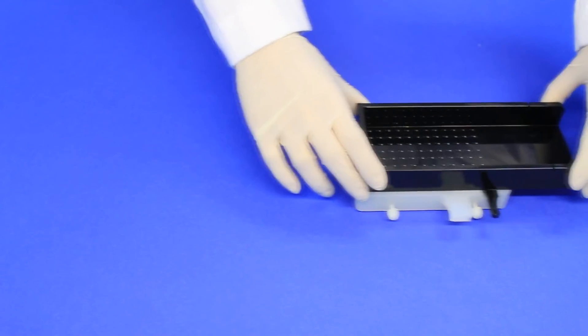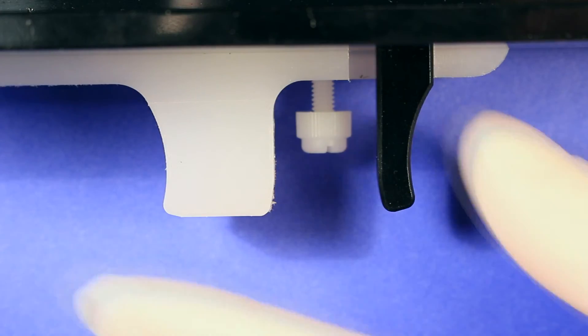Place the dispenser over the microplate. Engage the release bar and the stir elements will fall into the wells of the microplate.